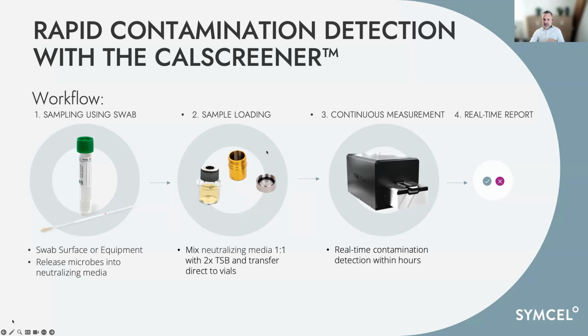If you're using these titanium vials, they will be completely sealed. So if you're taking your samples inside of the clean environment, you can seal them and bring them outside and put them into the machine, or have the machine inside of the facility. But they will be 100% sealed. So this also really limits the danger of contaminating your samples while doing your sampling.